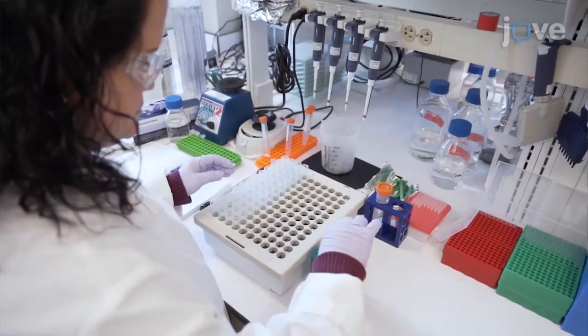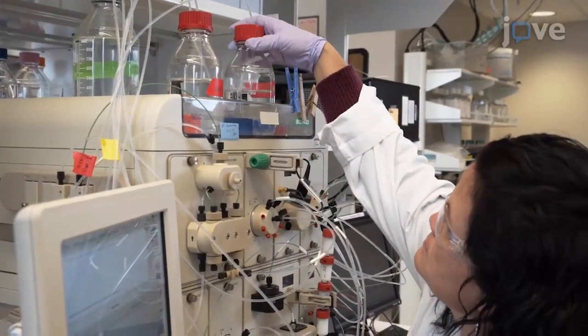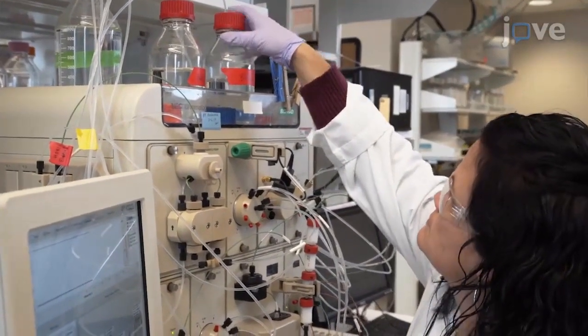We typically purify 3 to 5 milligrams of protein per liter of expression material. This allows us to conduct a variety of biophysical and structural biology experiments. KRAS is mutated in 20% of cancers and 90% of pancreatic cancers. So having a protocol to produce authentically processed protein is quite useful for developing drug screens so that you can study the actual protein as it would be on the membrane of cancer cells.